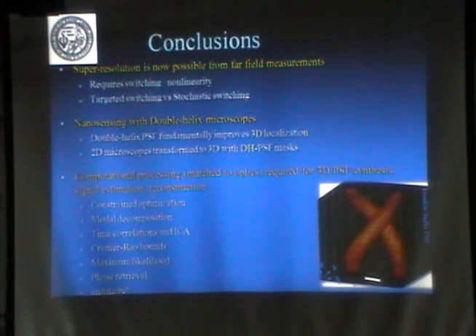Well, if you have higher magnification, you have lower field of view. And here it is the same. You can control parameters, so it's a class of PSFs. Now, are there others? Well, things go like this.